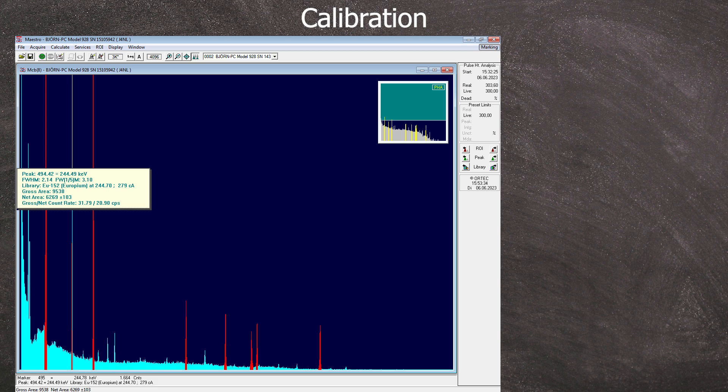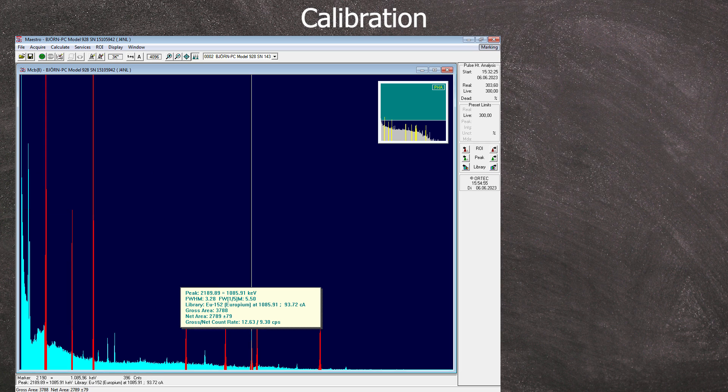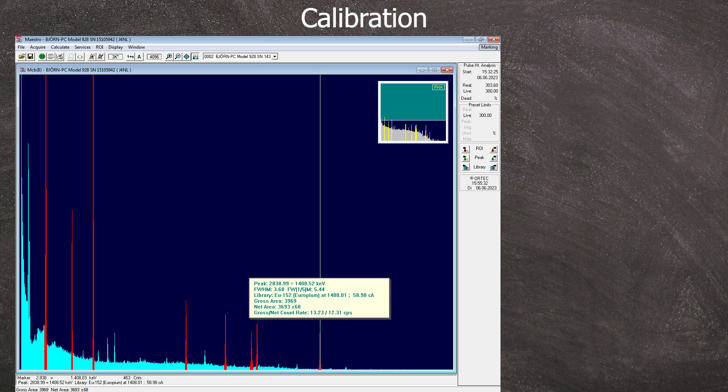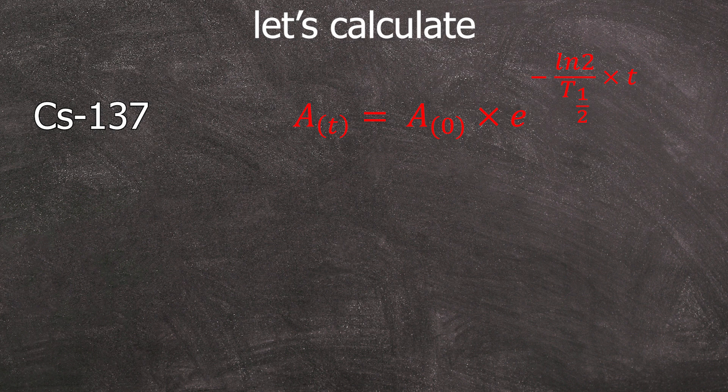Now you note down the net area CPS values from the marked ROI and now you're ready to do the efficiency calibration. On to the calculations. We here have the most important formula to calculate the activity of a sample on the measurement day. For this, the following information are needed.